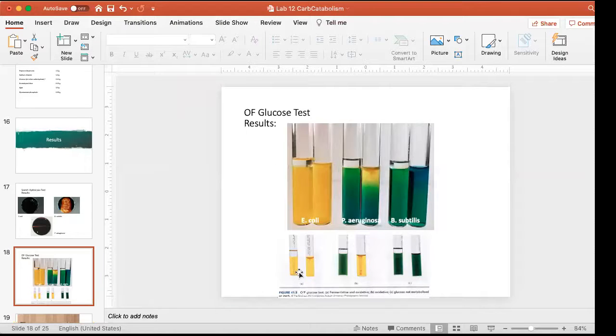This is another thing that we can do in the laboratory to investigate a bacterium, whether it comes from an environmental sample or a patient sample. We are often faced with identifying a bacterium in the microbiology lab, and it's our job to use different types of culture media to gather data about that organism.